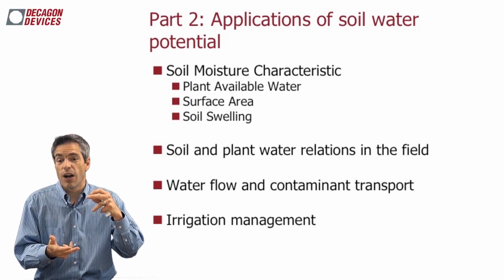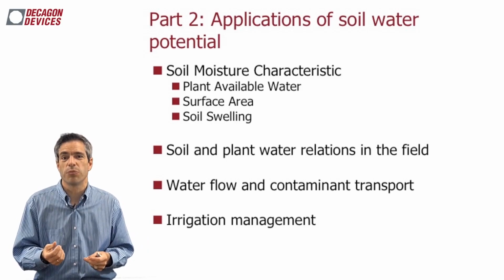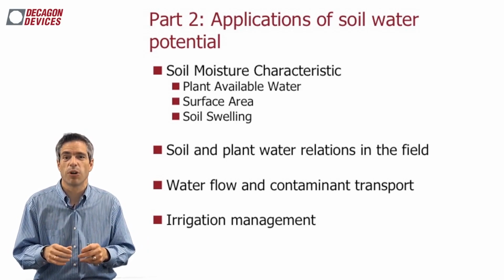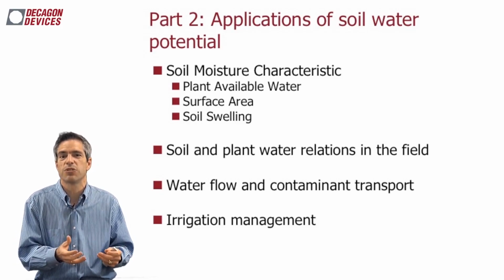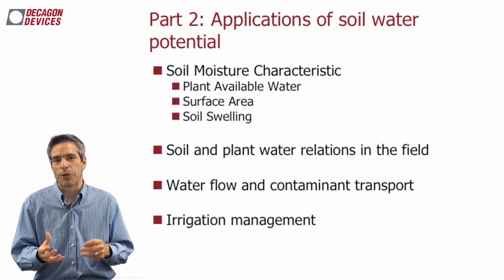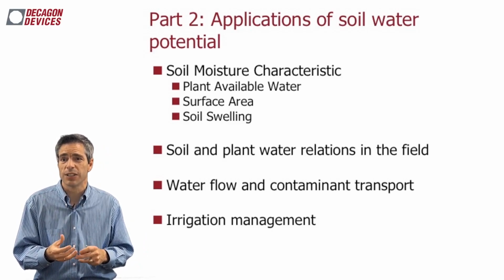inexpensive, very user-friendly, we'd love to make water potential measurements in the field. And we'll talk about some options there. Are we there yet? A headache-free measurement of water potential in the field? I don't think so. We're still working on that. But, you know, with time, I think we may get there.